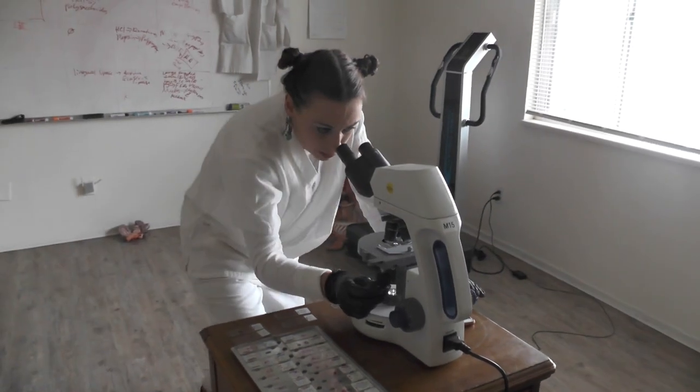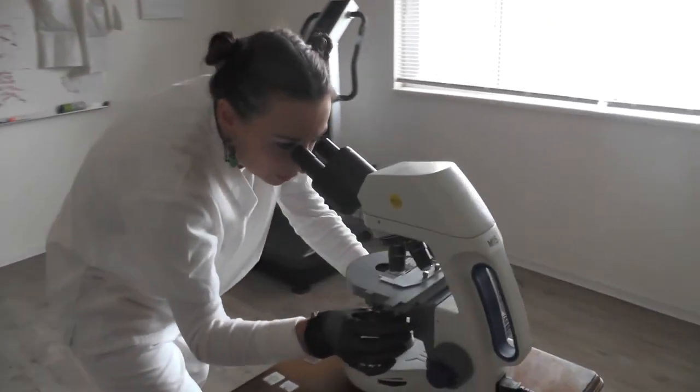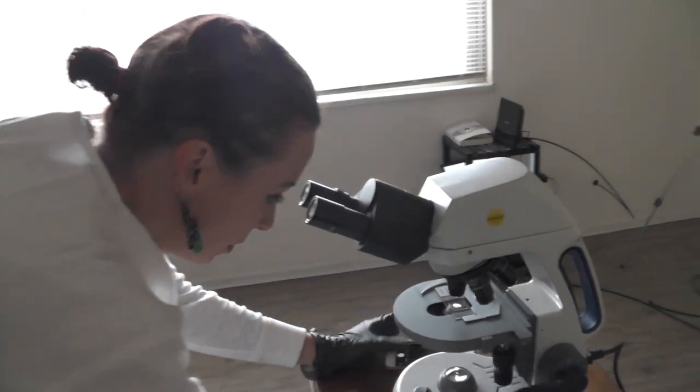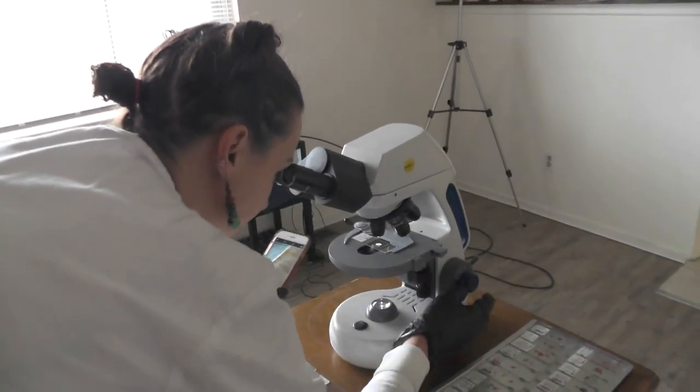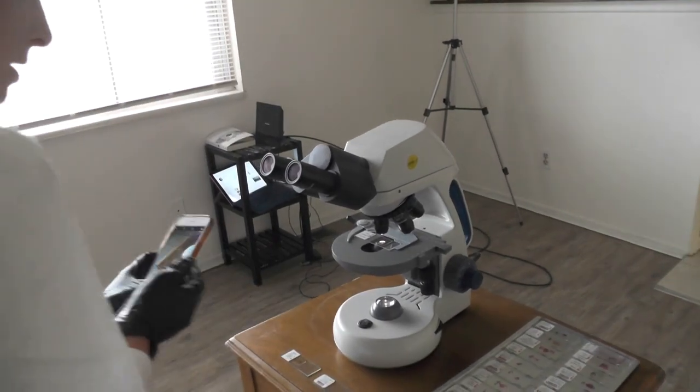So this first slide is the esophagus. And if you remember, our esophagus is exposed to abrasion on the inside. So it's got that non-keratinized stratified squamous epithelium.